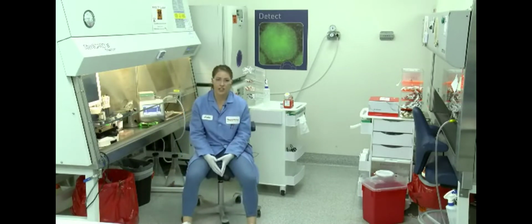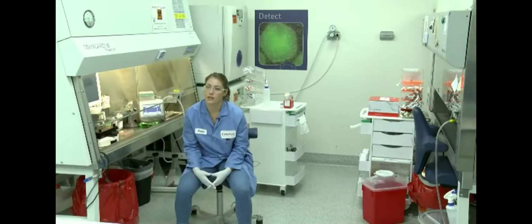So electroporation in general will give you a much higher transfection efficiency than other types of transfection such as lipofection, and particularly in instances like genome editing, you're really concerned with getting the highest transfection efficiency possible. So with the electroporation though, are you concerned at all about cell survival post-delivery?